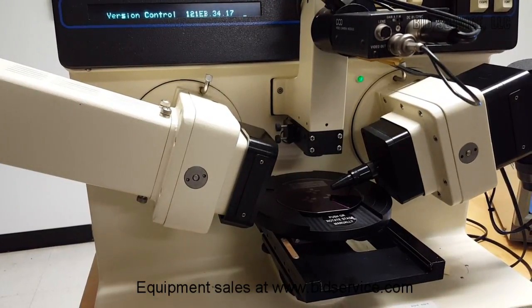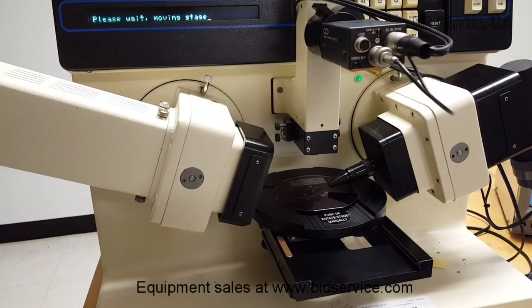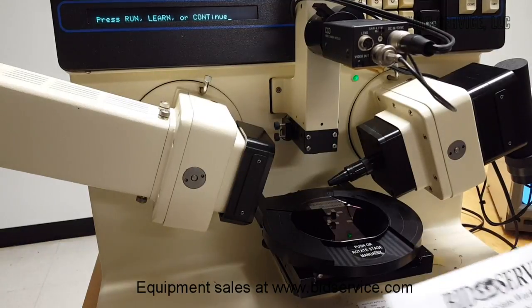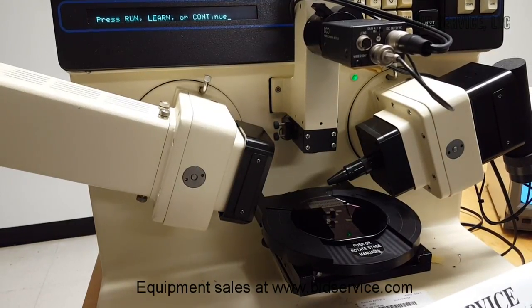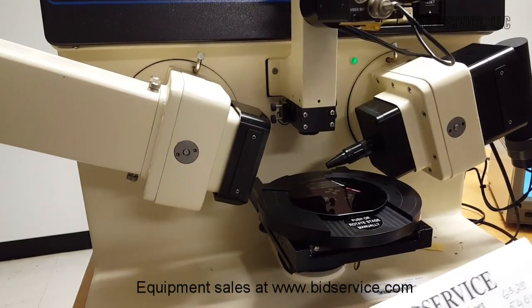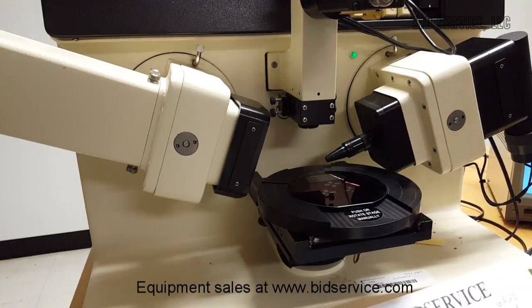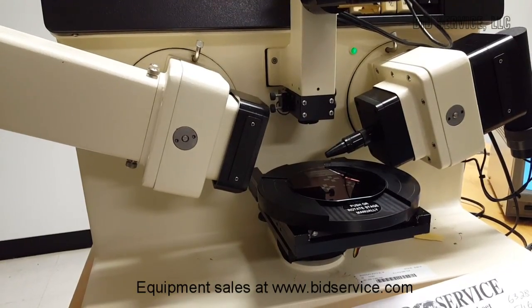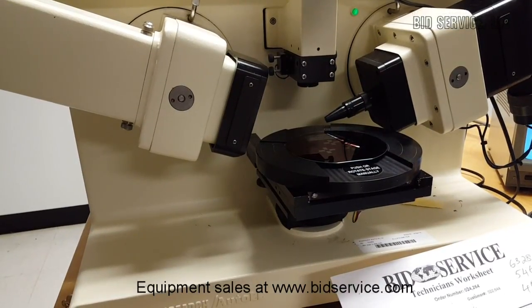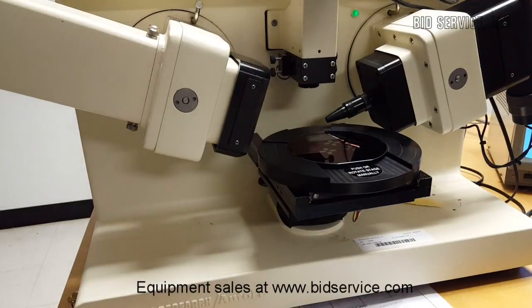The wavelengths are, in angstroms, 6328, and another wavelength 5461 angstroms, and 4050 angstroms. So the lambda value can be entered or selected by running a particular program number, which I'm going to demonstrate.